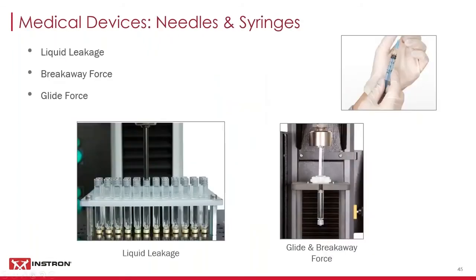There are a number of standards that provide test requirements for needles and syringes, including pre-filled syringes. An XY system can easily be adapted to run many of these tests, such as liquid leakage tests that are performed on vials, such as those shown in the photo, and on syringe closure systems. This could be a needle shield or tip cap. The test determines whether the closure system or plug can withstand possible excess pressures inside the device during filling or shipping.